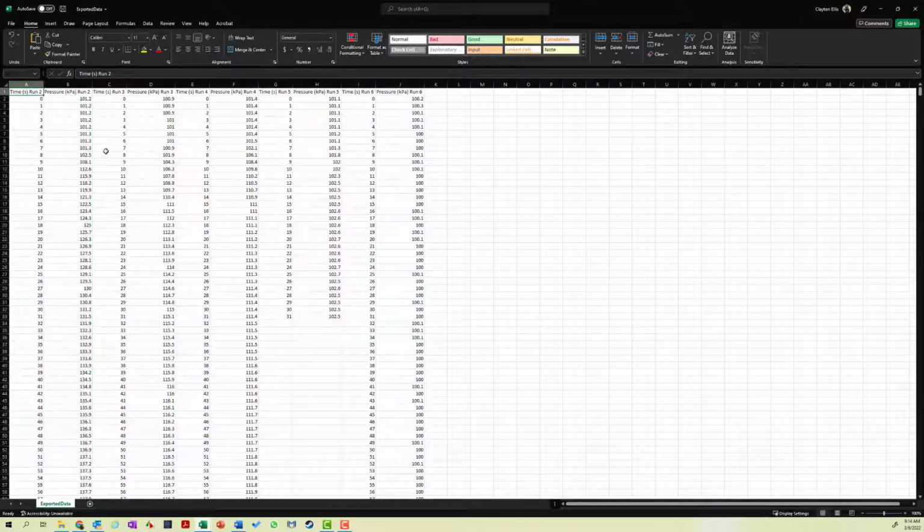So I'm not sure what was what, so I'm just going to make up these values. I'm going to say that run 2 was the pH, let's say it's temperature. Metal salts, let's say it's metal salts. So let's say that this is 1 molar silver nitrate. Same, copy, paste. So that's the time. Sorry, for pressure, 1 molar silver nitrate. Hit spell.